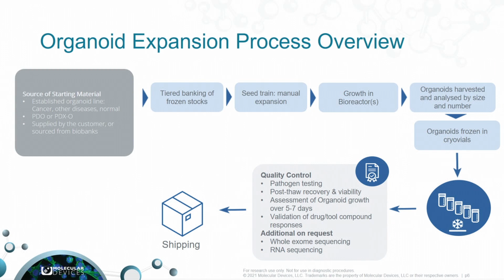And the advantage really is that all of those organoids have been handled according to set SOPs, so that operator-to-operator variability is minimal. They've all been handled using the same reagents, the same batch of Matrigel. So really we're trying to reduce all of those points of variability other than obviously what is innately variable within the model systems, because one thing that we're very keen to ensure is that we're not destroying the model system while we're going through this process.